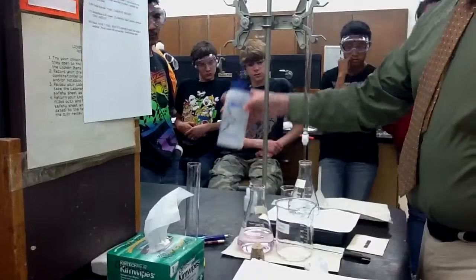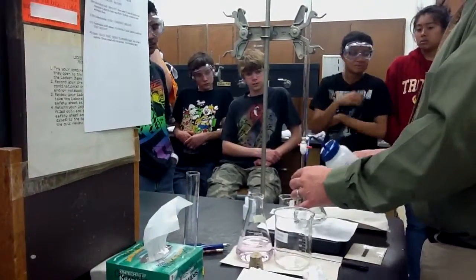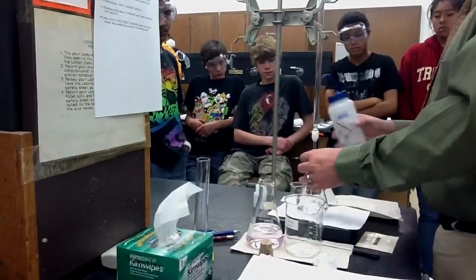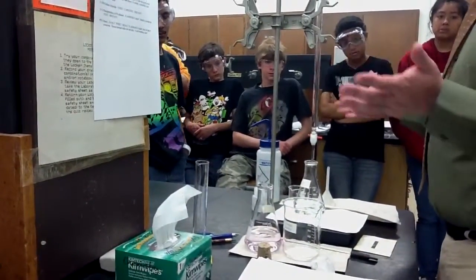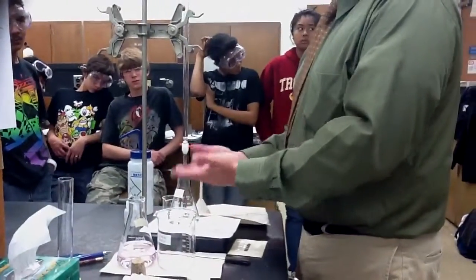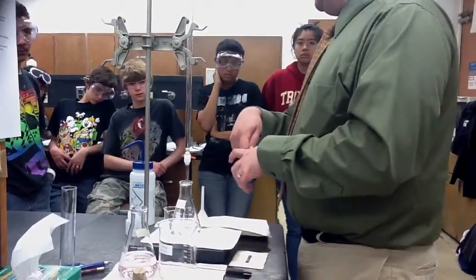At that point, as they mentioned, you should also take your squirt bottle with the distilled water in there, and simply squirt it on the sides here. That way, any of the base that happens to splash and hit the glass has to count, so it has to react. Also, any of the acid that splashed above, same thing, you want it to react as well. So from time to time, you want to do that as well, okay?